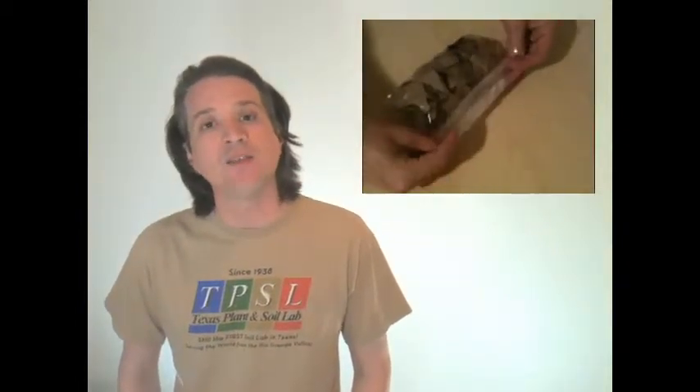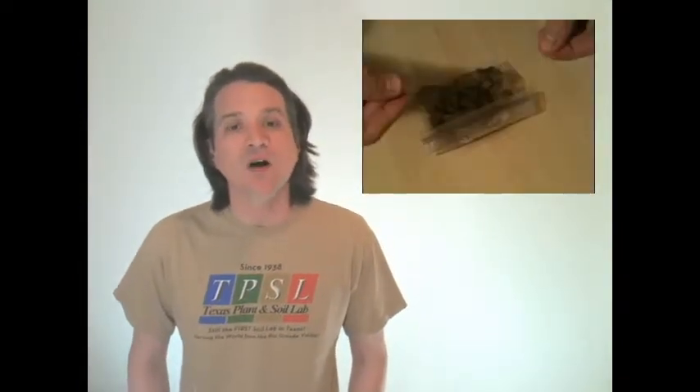Whether you're using the pre-printed paper bag from Texas Plant Soil Lab or a resealable plastic bag, once you have your soil inside, press all the air out of the top, seal the bag, and then roll it down toward the body of the bag — away from the side you wrote on. This gives you a tight wound seal close to the body of the bag. Then take a piece of packing tape and run it along the length of the seal as an extra measure of security during shipment.